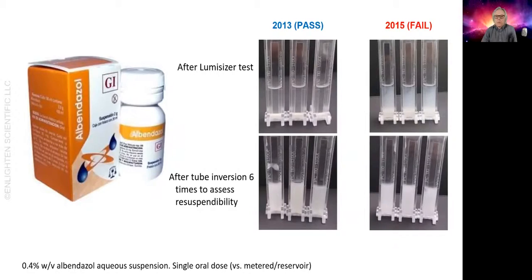In 2013 that wasn't an issue. One of the quality control tests involves a Lumisizer to centrifuge a sample, followed by looking at the appearance of the supernatant and then shaking the sample to assess the redispersibility of the sediment. In 2015 there were product failures. The amount of drug getting resuspended was low because it wasn't possible to fully redisperse the sediment.